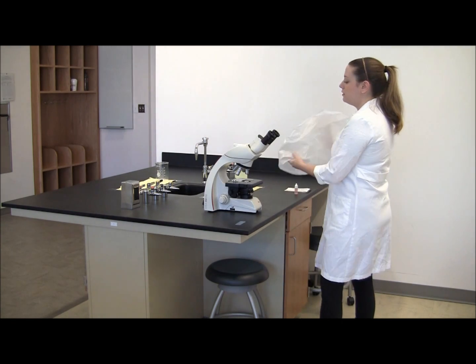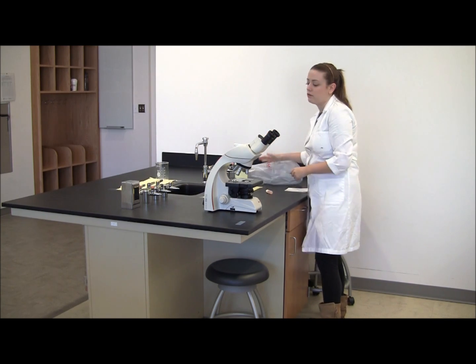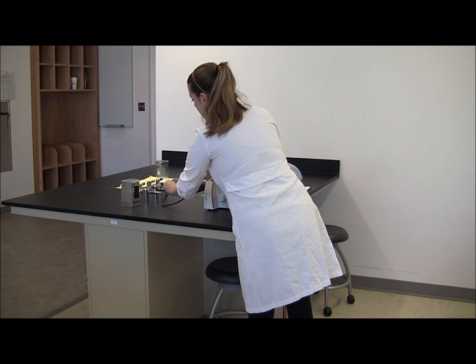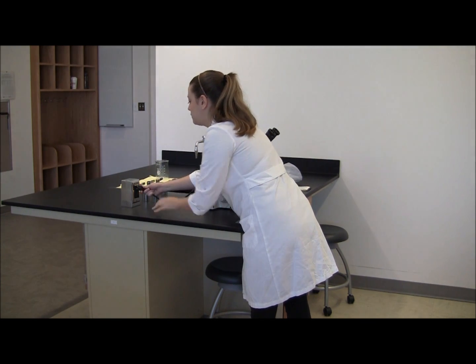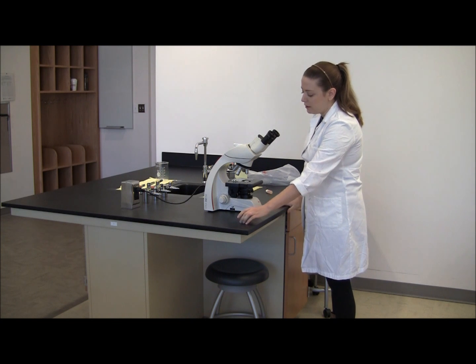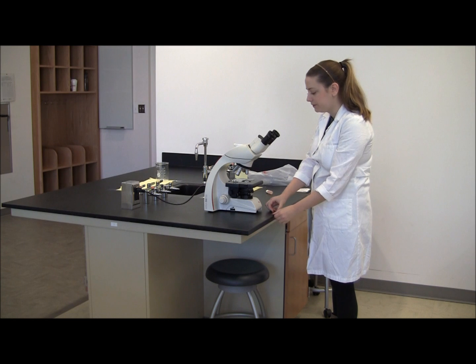The first thing you want to do is remove the dust cover from the microscope and place it somewhere where it's out of the way. The next thing you want to do is plug the microscope in. So, the microscope should be set on your lowest power, which is the 4x objective.